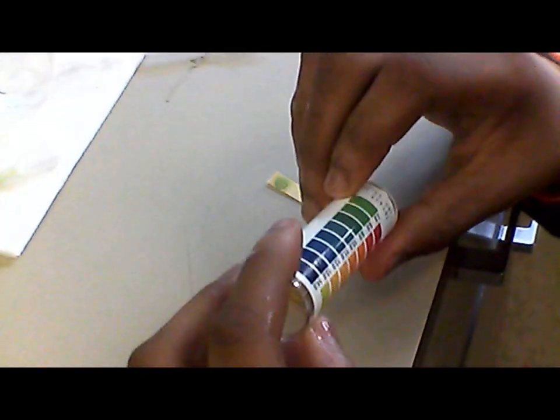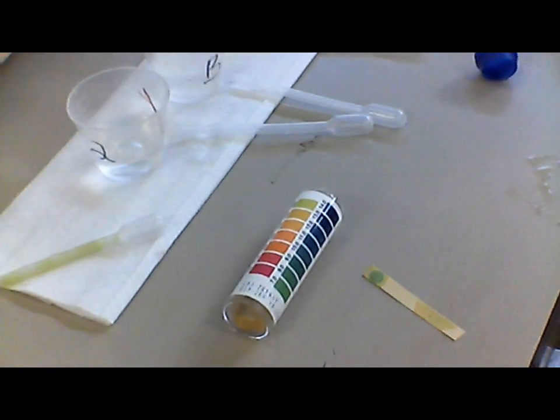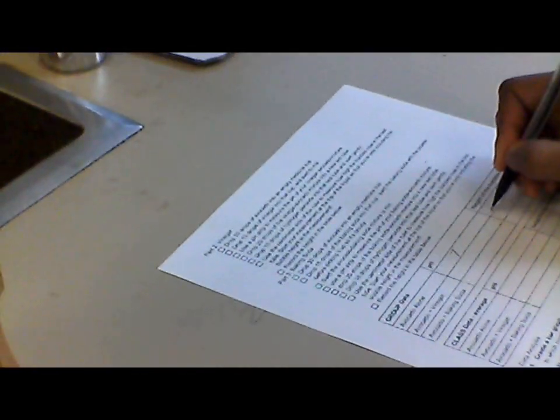Green. All right, let me see here. Like light green. What's green? Oh, green is a 7. So that's a base. Wait, is it green or is it a 7 or a 6? Let me get the green. Yeah, it's supposed to be green. It's a 7. Okay. So, avocado alone, it's a 7. Height of the bubbles. There are no bubbles.